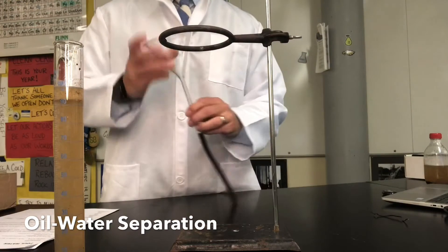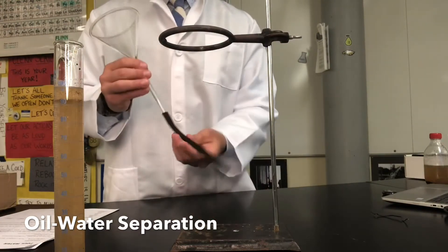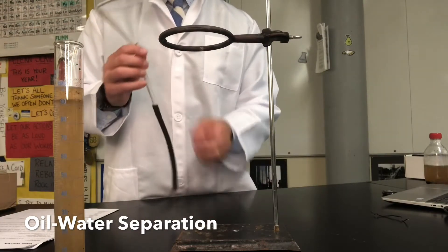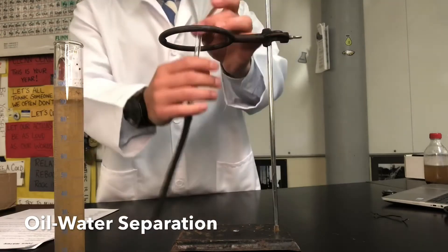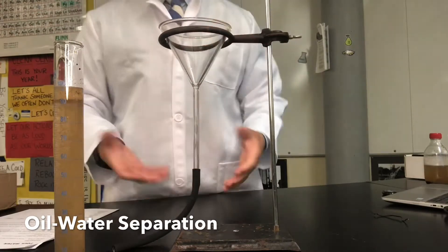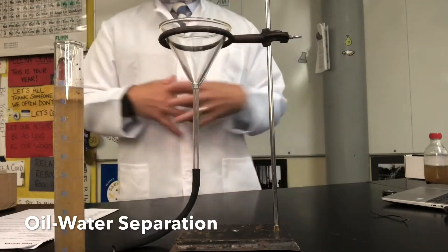For oil water separation we're actually going to be using a glass funnel with a little tube at the end. We're going to take advantage of the fact that oil and water are immiscible, meaning they don't like to mix together.